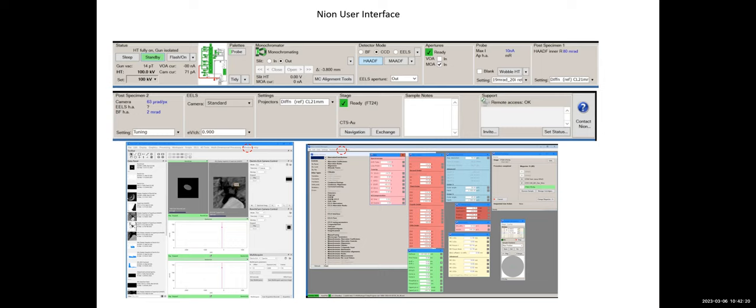Or if you don't have a compensation, the compensation is zero. Okay, now I want to get back to this CL setting alone. The advantage of this window is it will link to the compensation in each unique probe mode. So you will save such values in the probe mode and not affect others. Okay, so that's the rough idea.